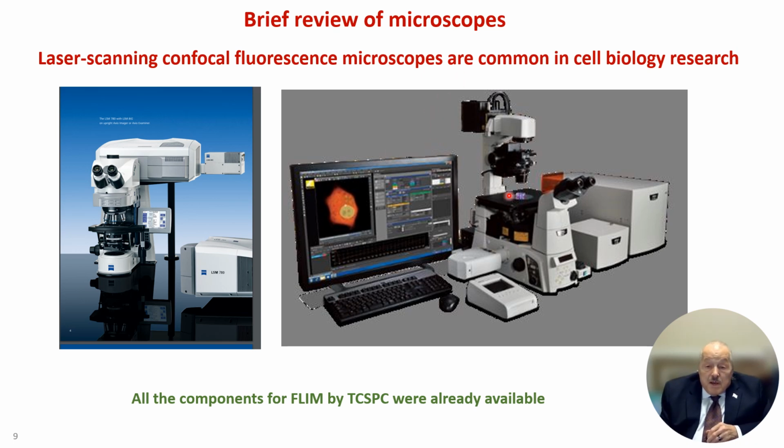The reason lifetime imaging by time-correlated photon counting took off so fast was that all of the components were available in 1990. They just hadn't been put together yet into FLIM instruments.